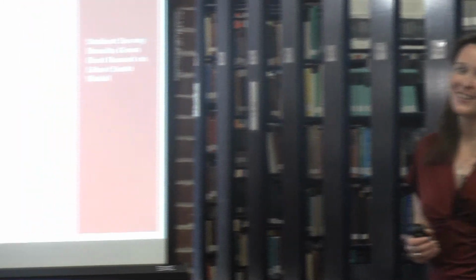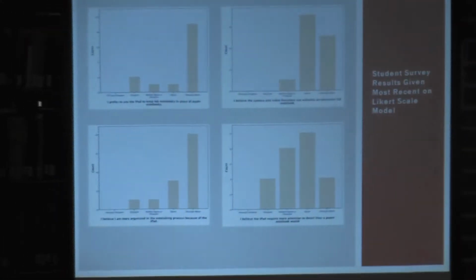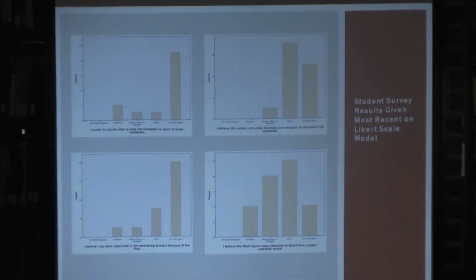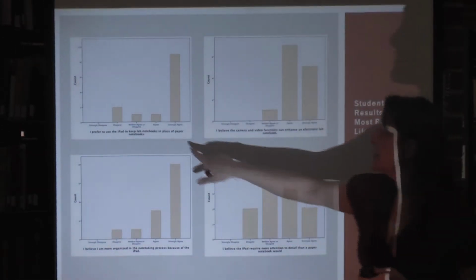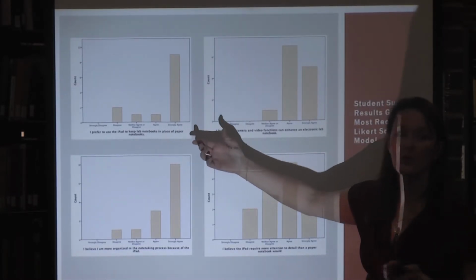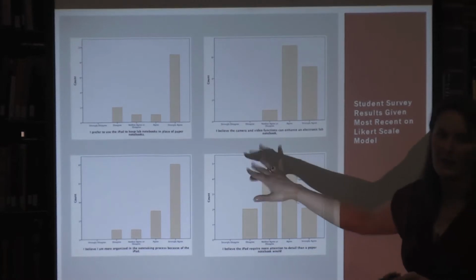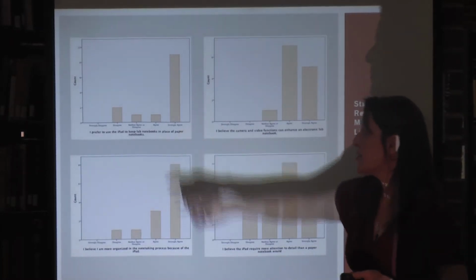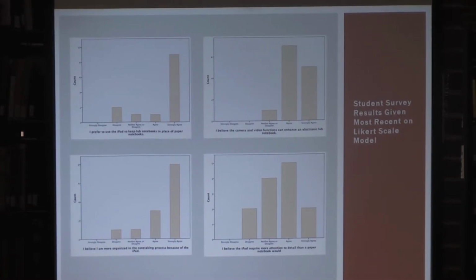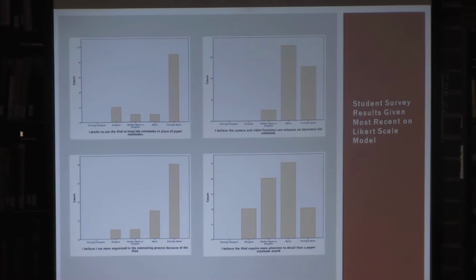We just started collecting some quantitative data just this last week from the students because we're getting to the end of the experience. So I'll just kind of show you some of their feedback on this. I prefer to use iPads to keep the lab notebooks in place of paper notebooks. We did this on the lecture too, but since we're talking about the lab, I've just included the lab here. So most of them strongly agree that they preferred the lab notebooks to what they knew about the paper notebooks. They've never had an experience with a paper notebook before though, so this is their only experience.